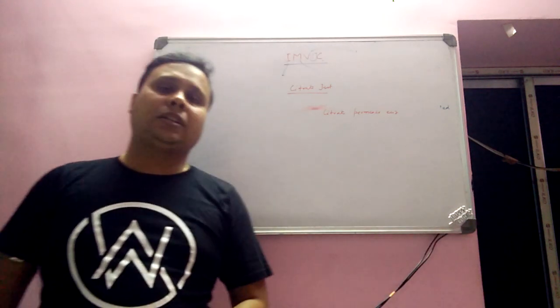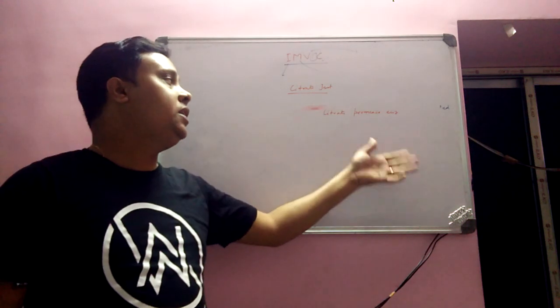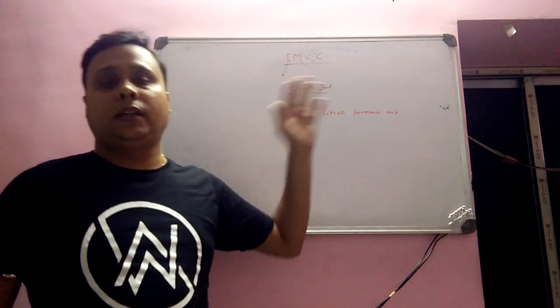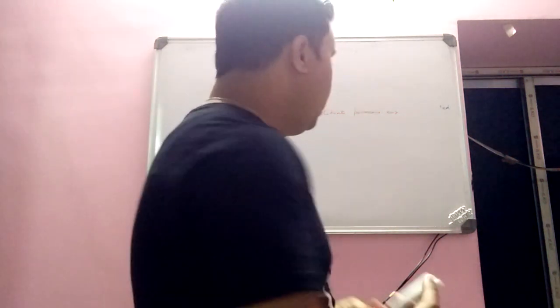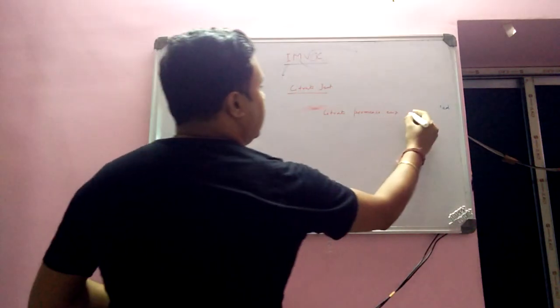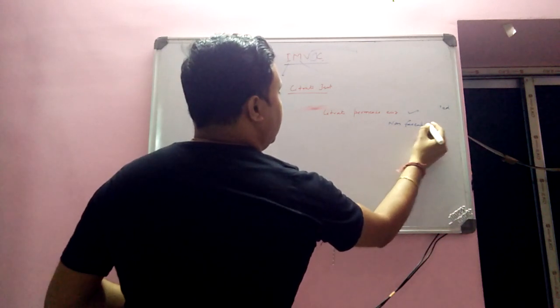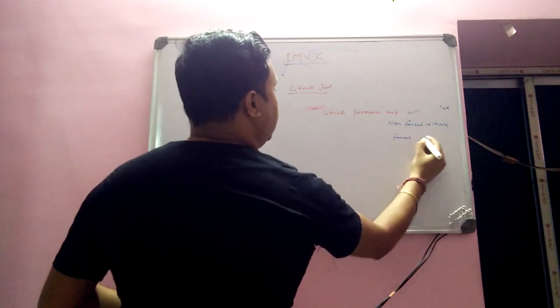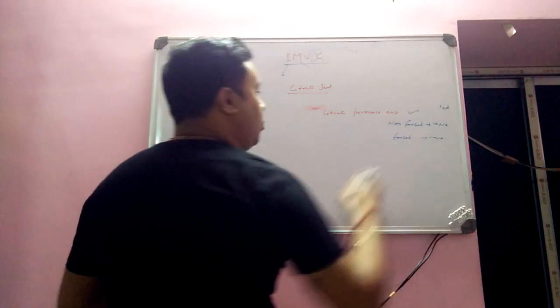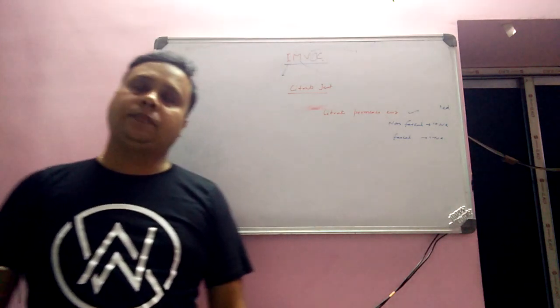So the appearance of growth indicates citrate positive. Because a fecal organism like E. coli is incapable of taking up the citrate from the media because it lacks citrate permease. That is why a fecal organism is not able to grow in the media. Right? So non-fecal organisms can grow. So non-fecal gives a positive test and fecal gives a negative test. So a positive or negative test can be determined by the appearance of growth in the media or not, right?